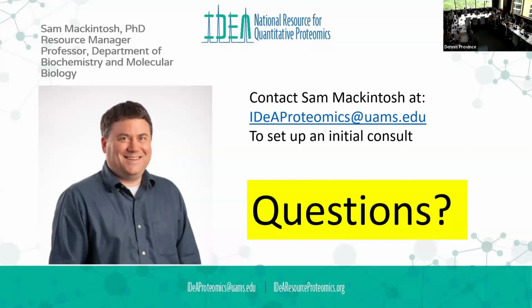So is there an alternative digestion technique? Well, I don't think that ubiquitination occurs at the arginines, so you still have those. And if you're not seeing what you want, you could go to a different enzyme. The other thing we do to make sure the trypsin works well is include Lys-C.